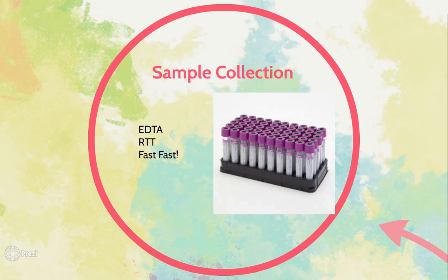Staining is going to depend on what your suspicions are about the sample, but typically we do a Diff-Quik stain on at least 1 or 2 slides, have a look. If you're suspicious of fungal or bacterial infection, then you might want to choose a Gram stain. Otherwise, Diff-Quik and Rapid stains are completely acceptable.